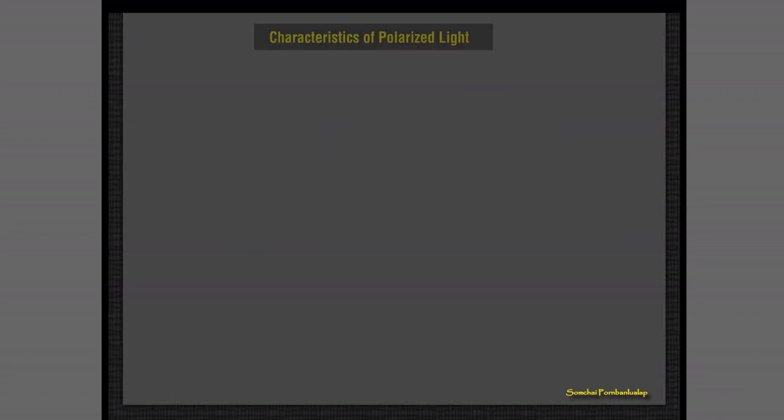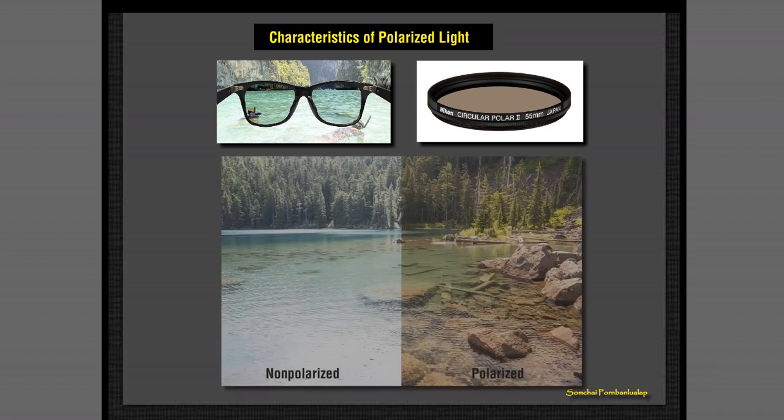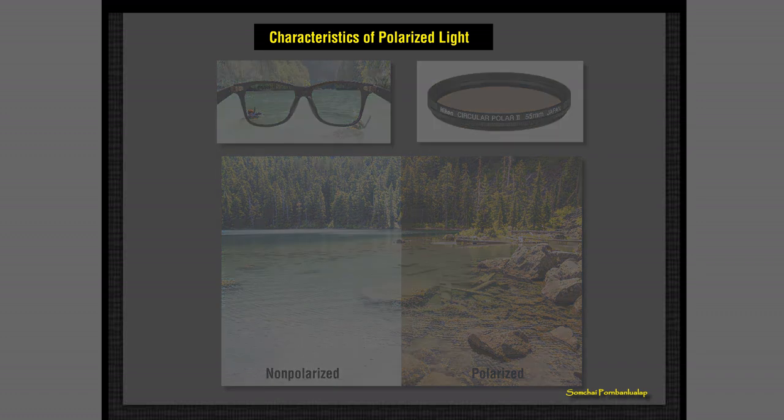Now let us examine what polarized light is. In everyday life, many people are familiar with polarized sunglasses. When comparing photos taken with and without a polarized filter, one may notice that images taken with a polarized lens show little or no glare.